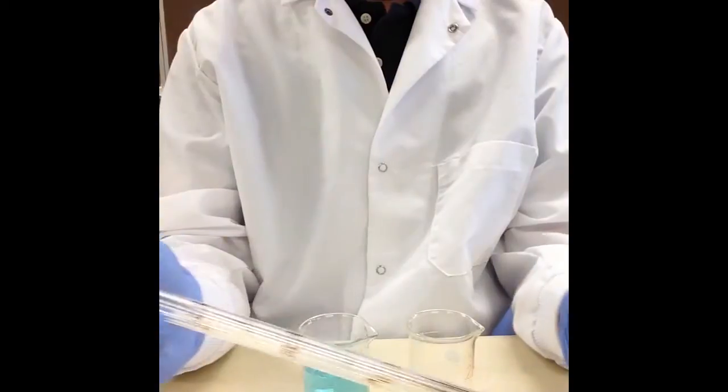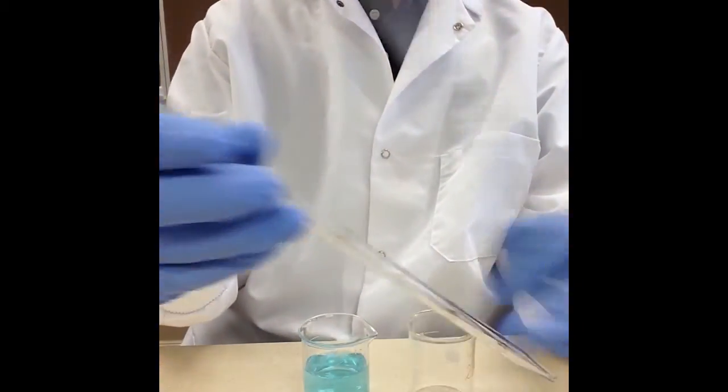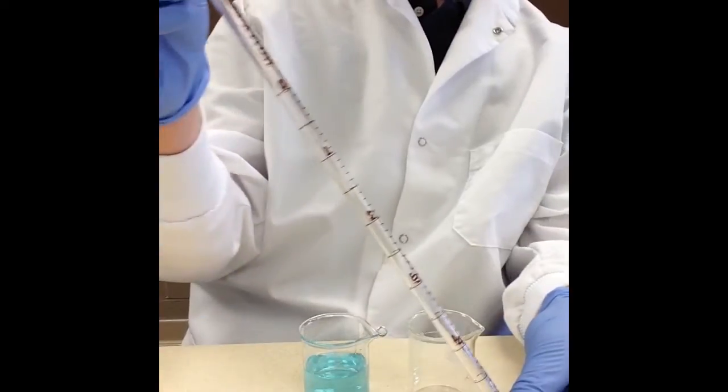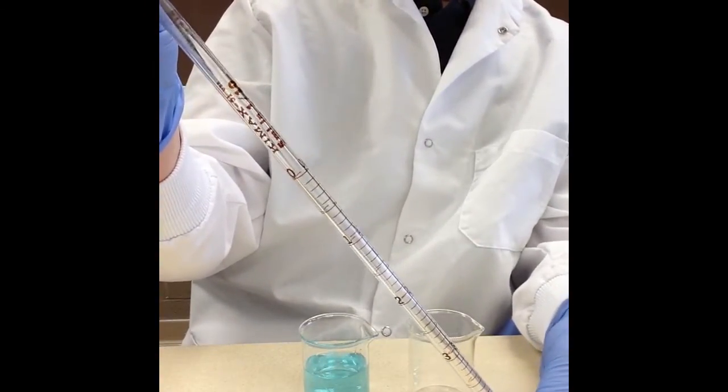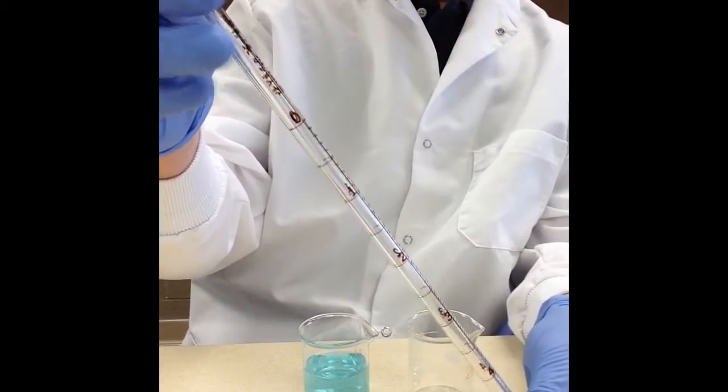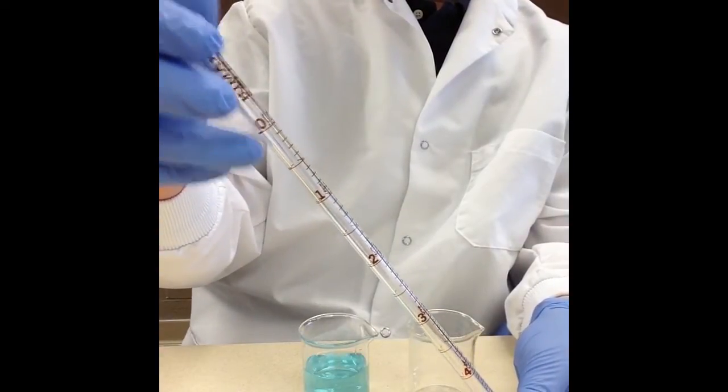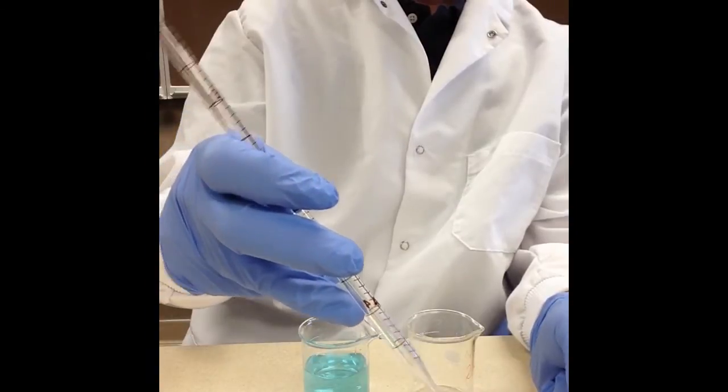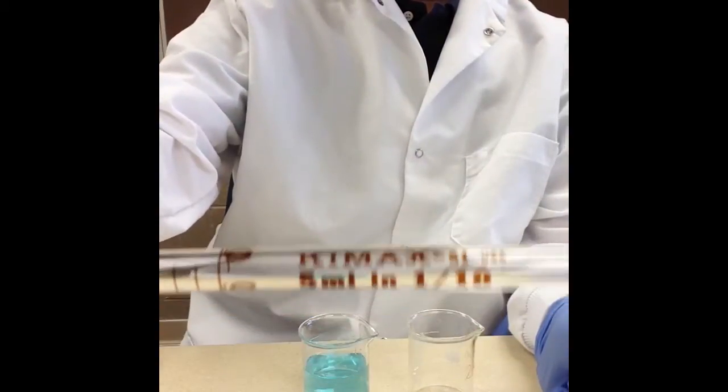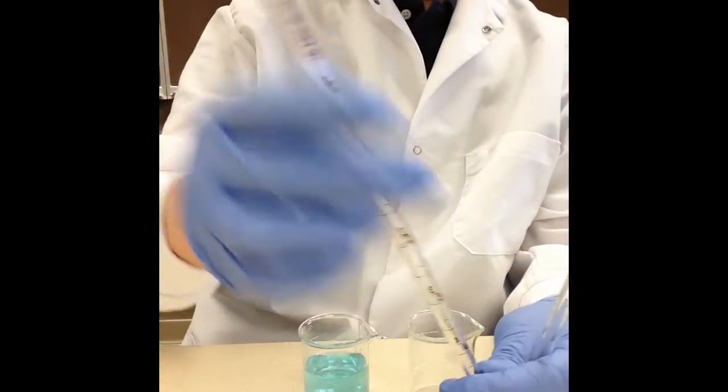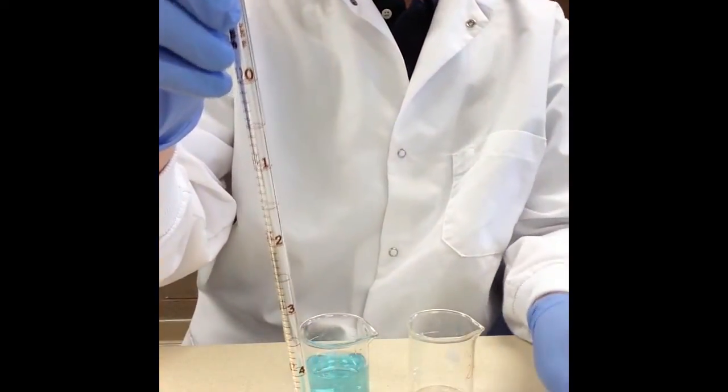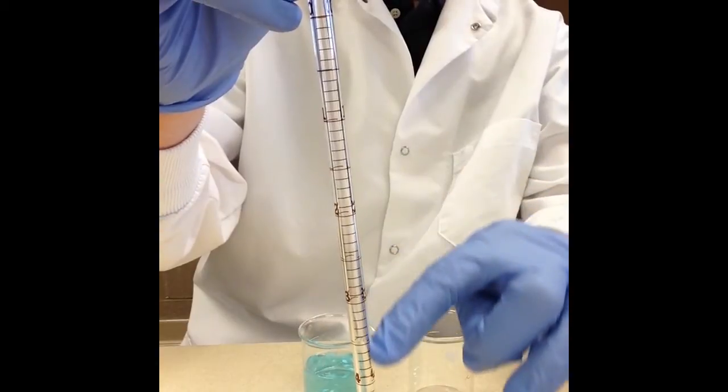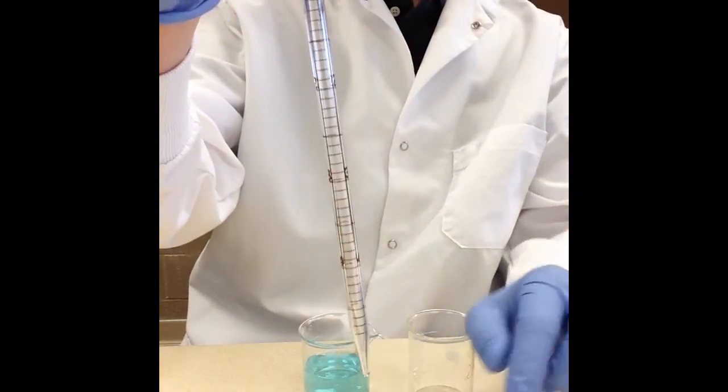The other two that we have are variable volume. This is a serological and this is a 5 mL serological and you can see that it starts here at 0, goes 1, 2, 3, 4, and then there's no 5. On the side it says this is a 5 mL, so basically what that means is if you want 5 mLs delivered you take it up to 0 and then you let it go all the way through the tip.